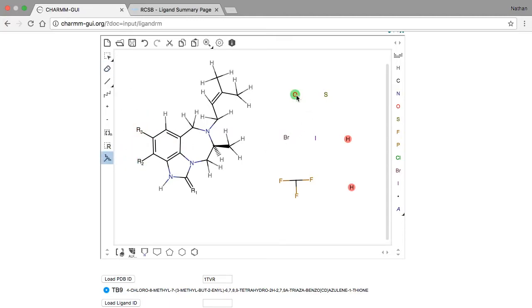Next, select the R group attachment tool. This is used to indicate in each replacement where the attachment is occurring.